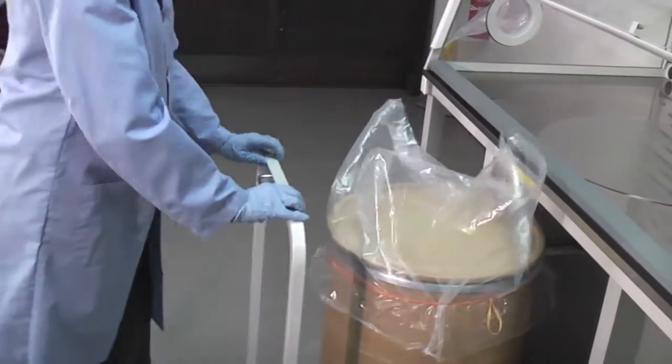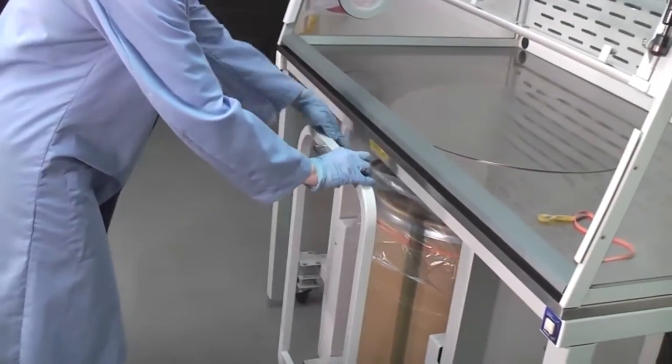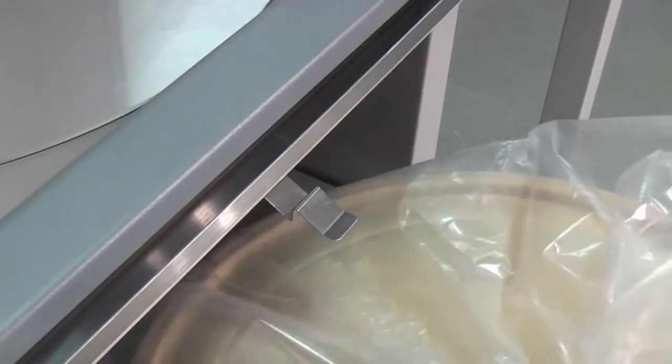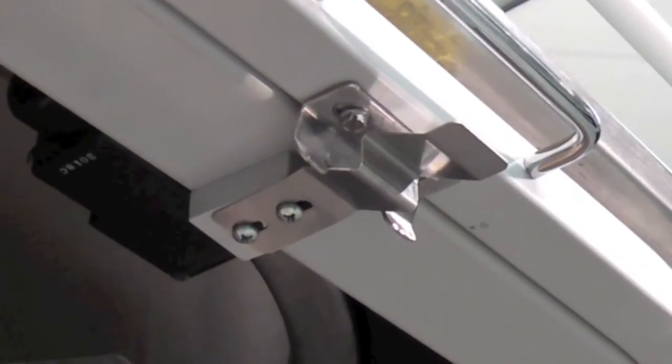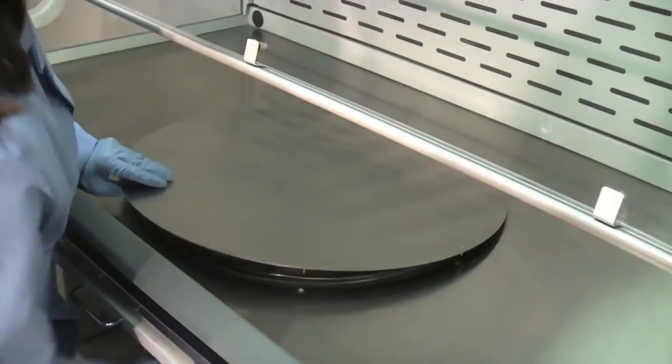Check that the caddy is latched, then push it under the work surface. Latching ensures proper alignment of the source container with the access opening. Remove the access opening cover.